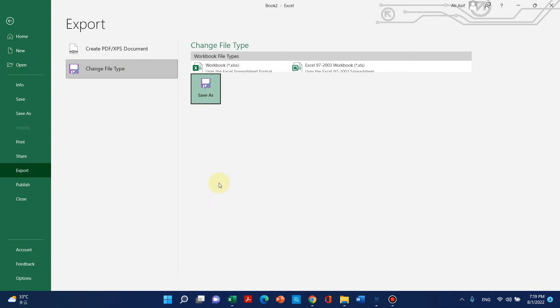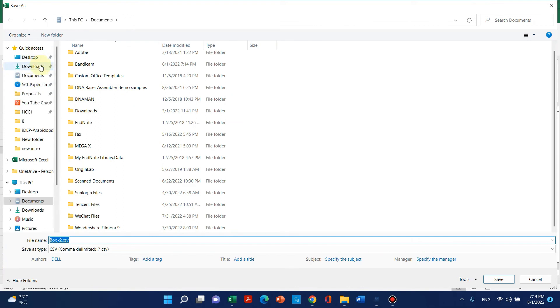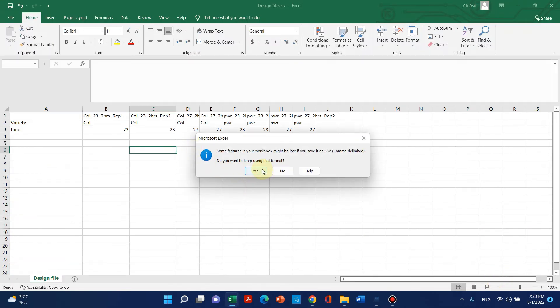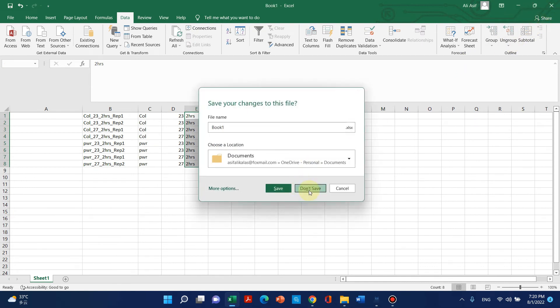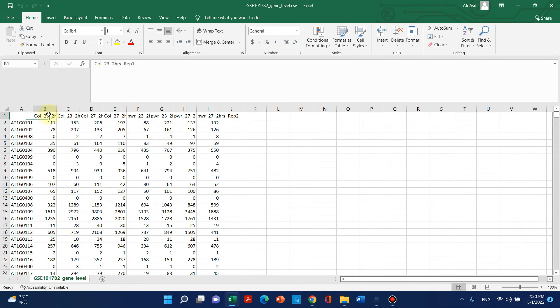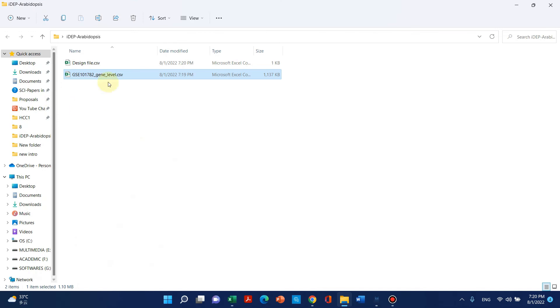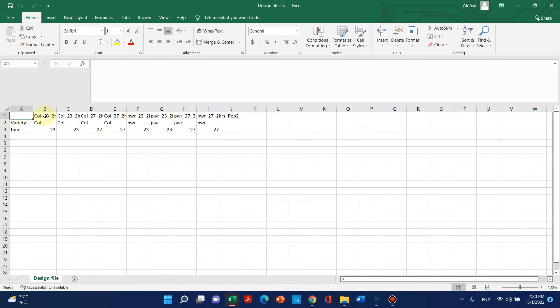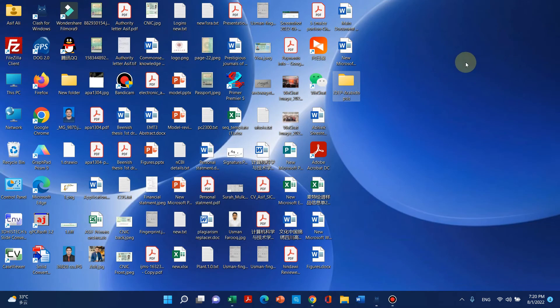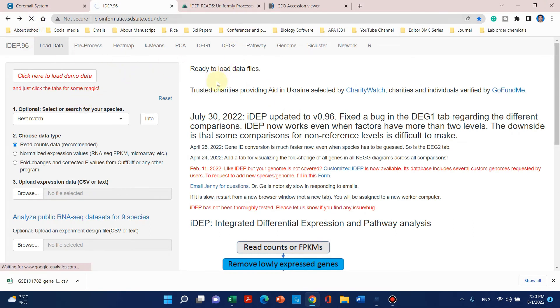We also save this design file as CSV, naming it 'design file' on the desktop in the IDEP folder. Before uploading, let's review what we have: the expression file has eight treatments with matching column headers, and the design file has those same sample names in its first row — matching exactly with the expression data. The first line of the design file must be the same as the expression data column headers.